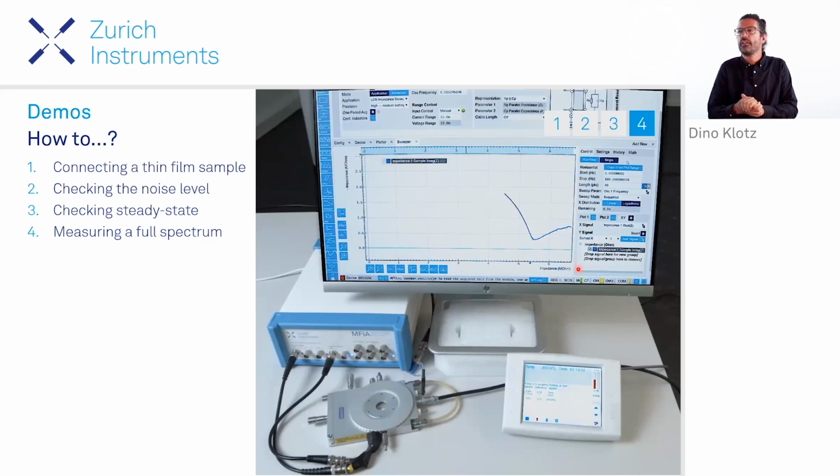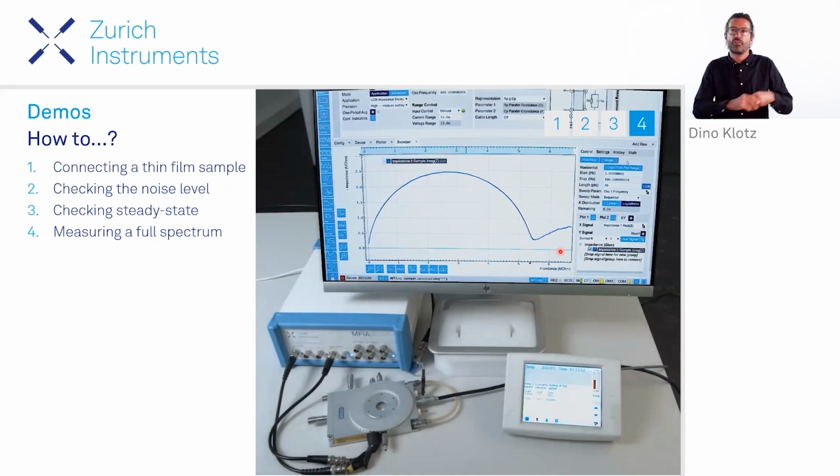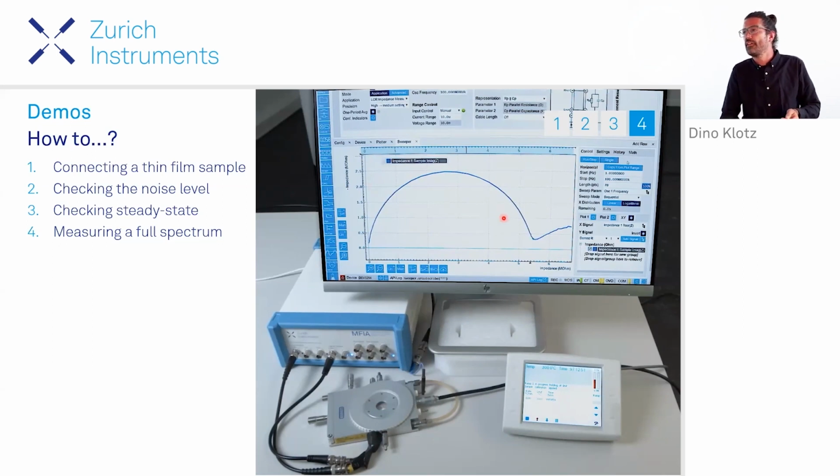So you see that this measurement that we analyzed before looks actually very nice, very low noise. I have here the clip with the grounding still. And so within 30 seconds, we get our impedance spectrum of our operating point. Yes, and then we can look at the peak frequency at this resistance. This is the 5.5 mega ohm. And so we can measure electrochemical impedance spectroscopy.